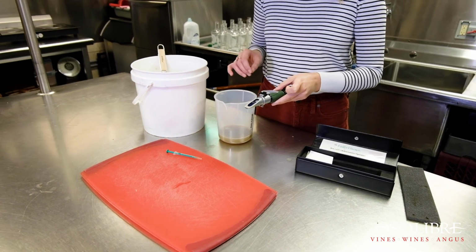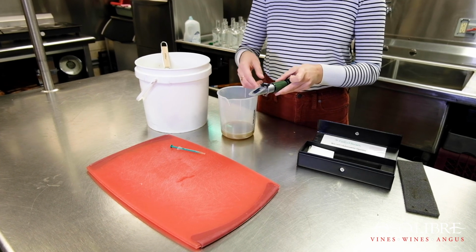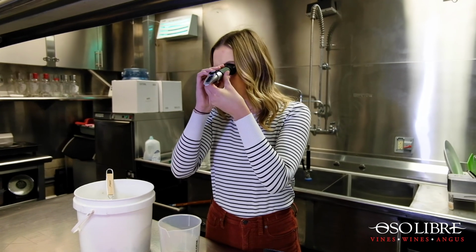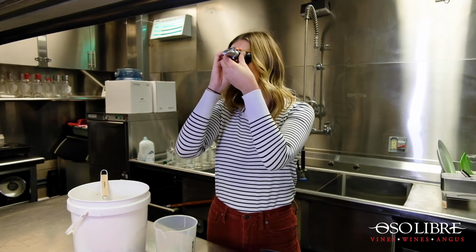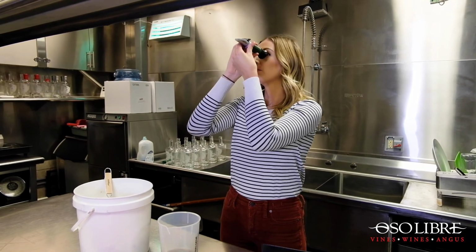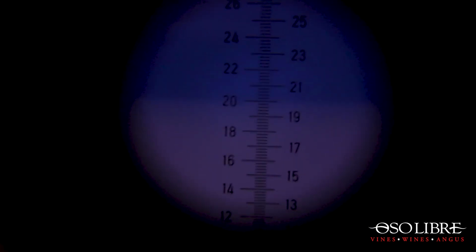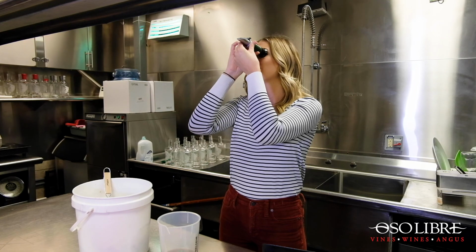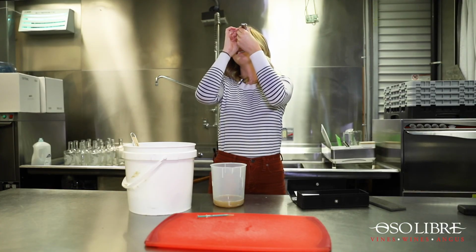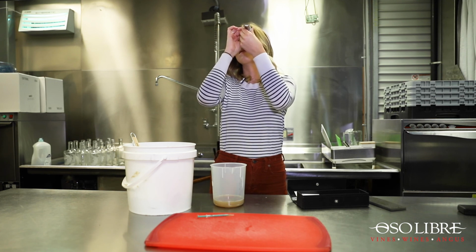And then the top prism, go ahead and flip it over. Let it slam. There you go. Now look through the device, the eye hole. Hold it up to the light. You should see a range of numbers. And you should see blue and white. Can you see a defining line between the blue and the white? Yes. What is that number? It is just under 20. So that is the sugar level of the grapes that we sampled today.